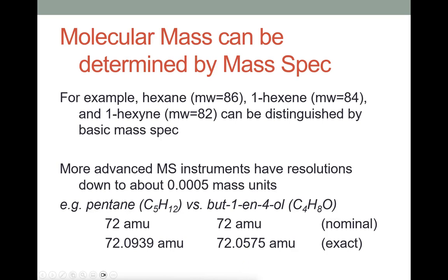And with the power of computational analysis and databases built into these instruments, although you and I, in the context of casually looking at a mass spec in class, can pick out some functional groups and figure out some branching structures, the instrument itself has the ability to resolve very closely similar molecules.